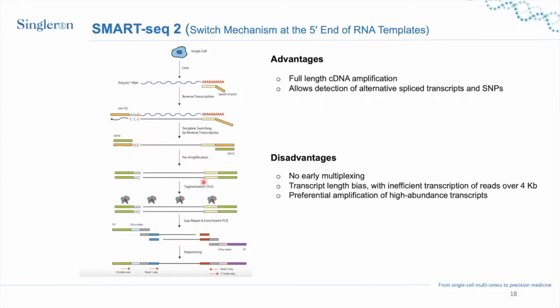After amplification, as I said earlier, due to the limitations of Illumina sequencers, we have to fragment our DNA. But here they use another enzyme called Tn5 transposase. What it does is called tagmentation. So it tags and it fragments at the same time. Basically, after it fragments, it adds these tags, which are indexes and adapters. And later on, we get sequencing-ready libraries.